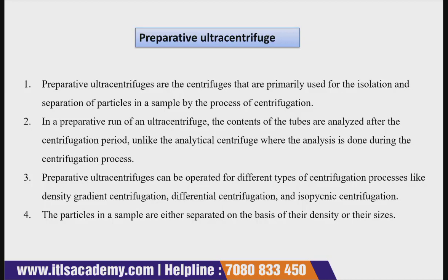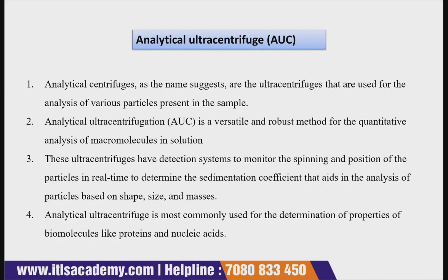So the analytical centrifuge is a very versatile and robust method whenever you are doing quantitative analysis of macromolecules in a solution. We all know that macromolecules are those molecules that are very big in size.